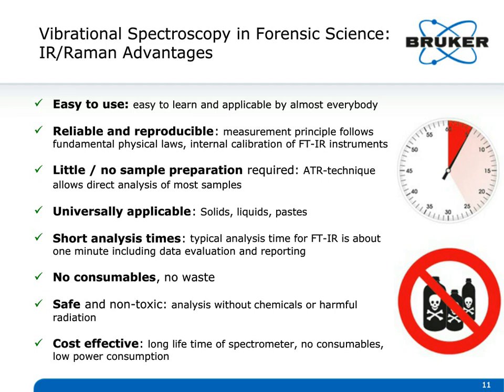The expected lifetime of a decent FTIR or Raman system is on the order of 10 years. So again, after the initial investment, it's relatively inexpensive to move forward and do the analysis with very little operating expense. And with that, I'd like to thank you for your attention and turn the time back over to Trevor.